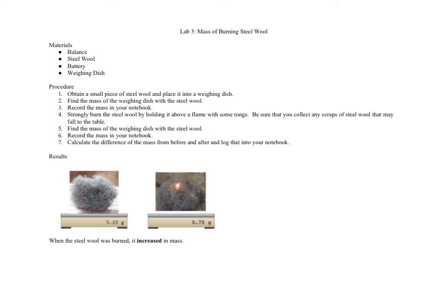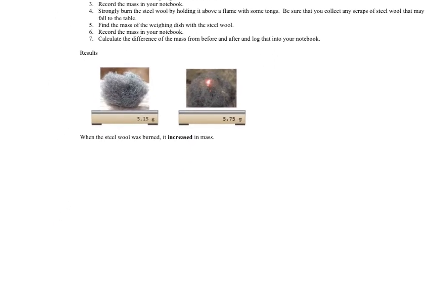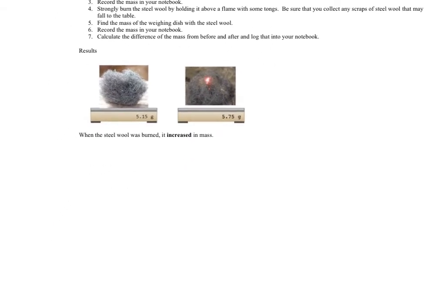Now we've got some steel wool that is burning. You may predict that when you burn steel wool its mass would decrease, but actually it's combining with oxygen from the air to increase its mass.